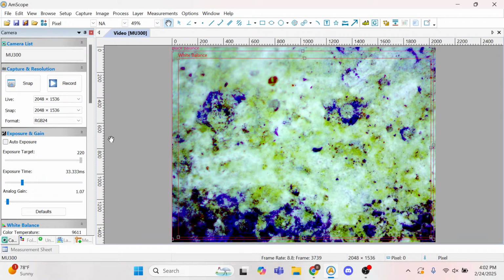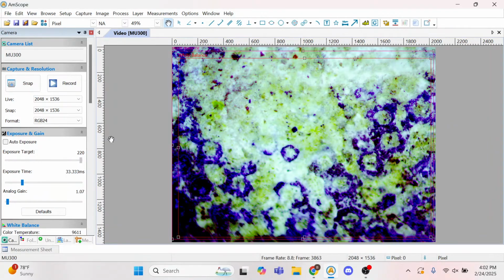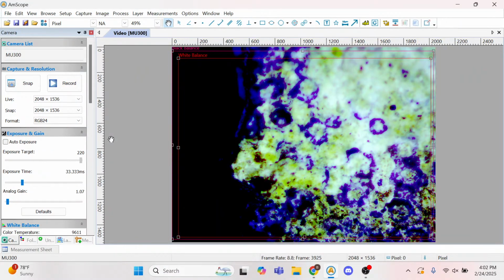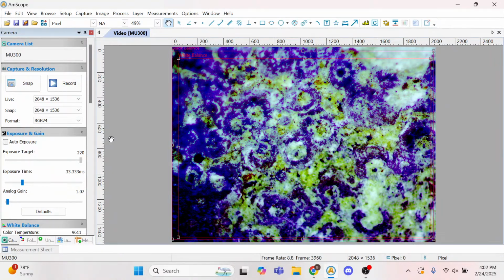So what you're looking at today are, I'm going to bring 3 different species to look at. The one you're looking at right now is a sauropod called Saltosaurus. These are extremely common eggshell fragments found by the tens of thousands in South America. And already you can see lots of interesting little pores.